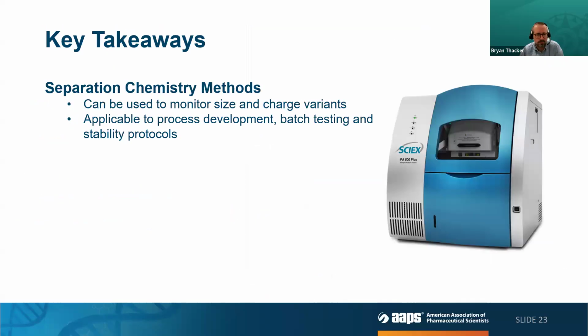Next slide. Okay, so just to wrap up here about some key takeaways from the separation methods. Methods that we've shown today can be used to monitor the size and the charge of the proteins, and they could be applied to the process development, batch testing, and stability protocols for each drug product.